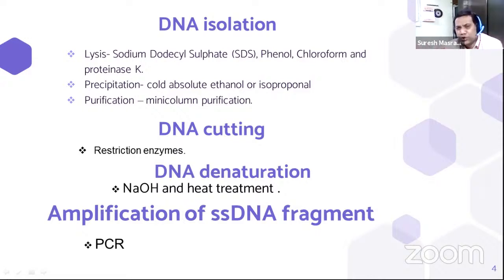Then we also use phenol to separate out the intimately attached protein from the DNA. This intimately attached protein means histone proteins, which are intimately associated with the DNA.